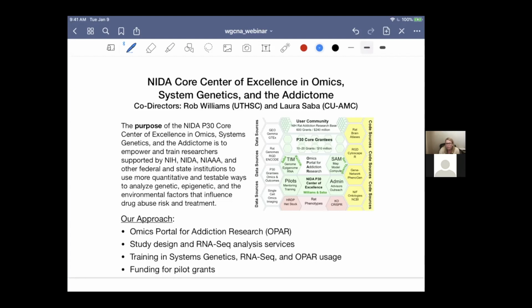Yeah. One of the other reasons that it might not impact the way that we apply it in the lab is that we're really looking for some of the smaller modules. And what we see tends to happen is that those genes that weren't variable tend to get thrown into that first module that's really big, and there's very little variation in that one. So it does probably depend on how you're going to interpret it or what you're going to focus on in the end.